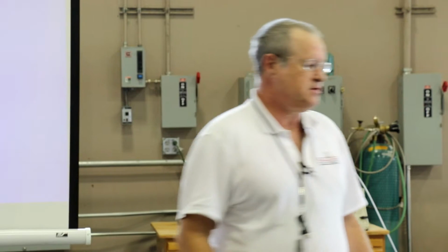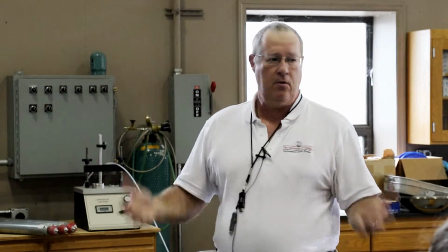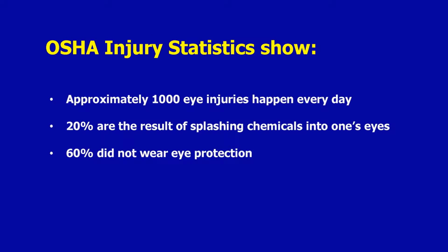To me, as a professional industrial hygienist, this is a bit of a bothersome statistic. How could this be reduced? By making sure that people who are exposed to eye hazards do what? Have eye protection. Simple solution. Very simple solution.